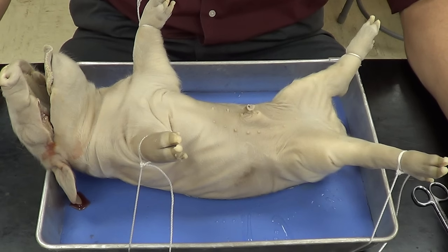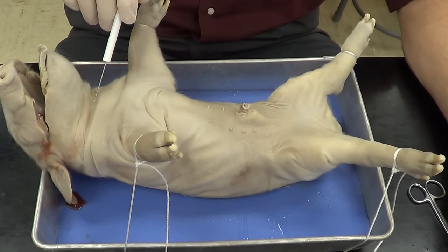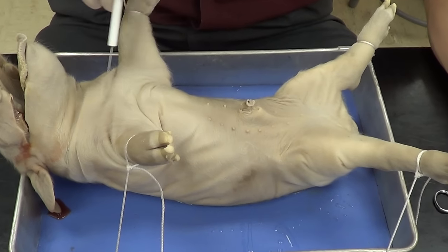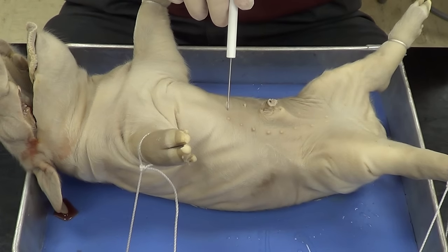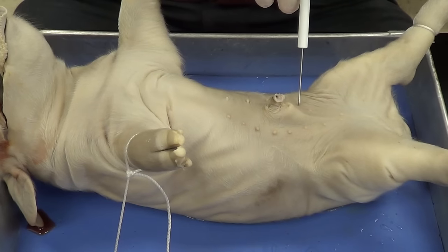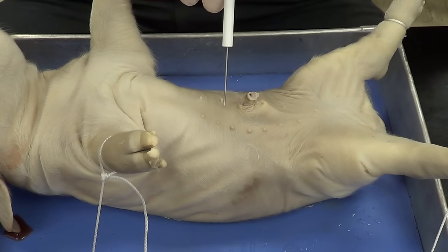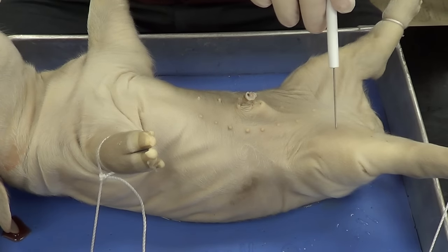I'm going to start my incision at the chin, and I'm going to cut all the way down through the chest. I'm going to cut through some of the bones, which are still cartilage here, and cut down towards the umbilicus. I'm going to go around the umbilicus, not all the way around, but around the umbilicus and then towards the extremities.